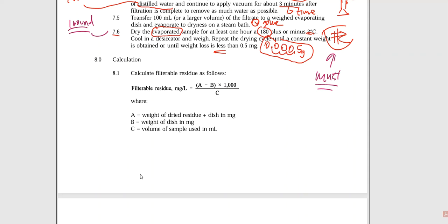And if you have a spreadsheet, well, guess what? The spreadsheet very often will do these calculations for you, because the company doesn't trust you to do the calculations. They will do it in the form of a spreadsheet that you go into and key in a value, and then that number just pops up on the spreadsheet.